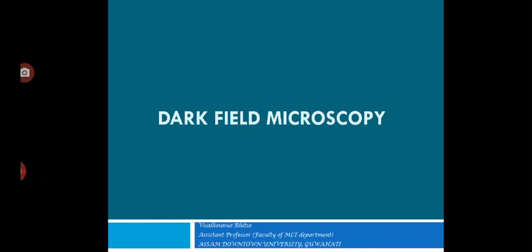Hello everyone, in this video I'll be explaining the applications, advantages and limitations of the dark field microscope. This dark field microscope is also an optical microscope, also called dark ground microscopy, which describes microscopy methods in both light and electron microscopy that exclude the unscattered beam from the image. As a result, the field around the specimen, that is, where there is no specimen to scatter the beam, is generally dark.